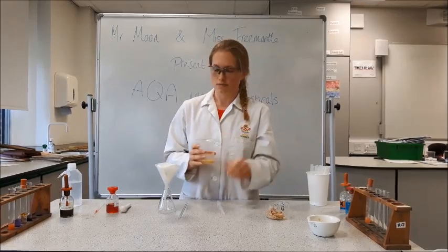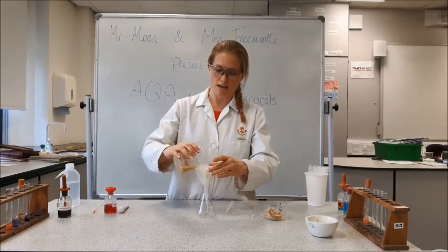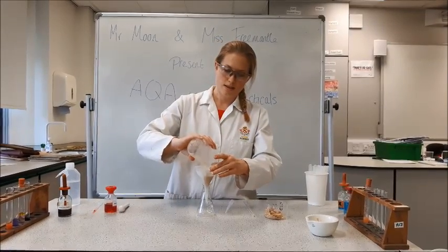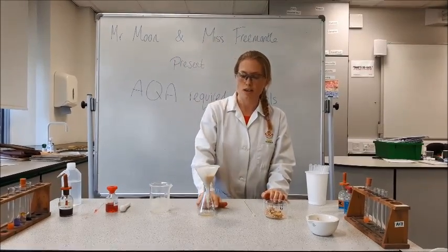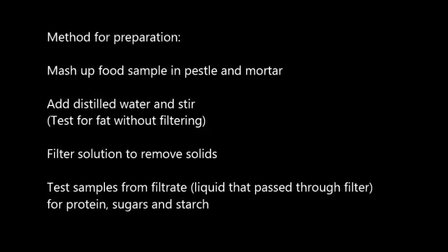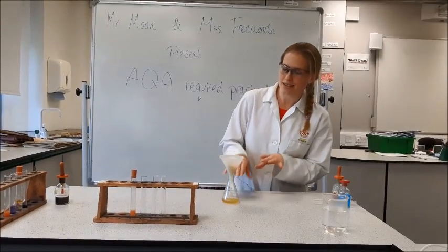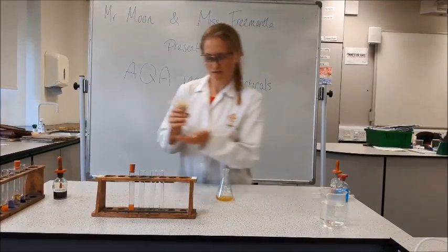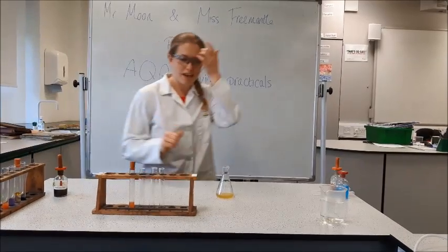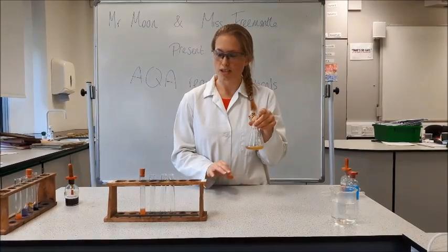The next stage is to filter our biscuit and water mix. I've got some filter paper on top of my funnel, and I'm going to pour in the biscuit into the conical flask and let the solute go through, because this is what we're going to use for the rest of the tests. Our solute has successfully separated out from our biscuit. In the flask we have our solute, which hopefully has starch, reducing sugars, and protein dissolved in it.